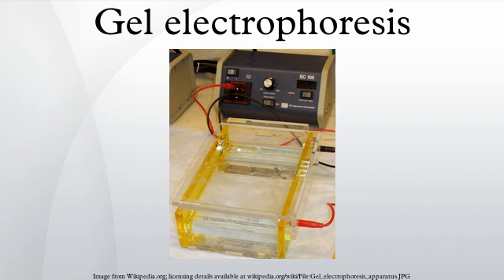Stacking gel is poured on top of the resolving gel and a gel comb is inserted. The percentage chosen depends on the size of the protein that one wishes to identify or probe in the sample. The smaller the known weight, the higher the percentage that should be used. Changes on the buffer system of the gel can help to further resolve proteins of very small sizes.